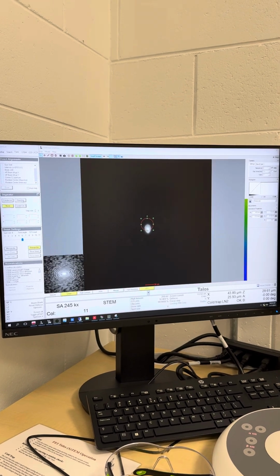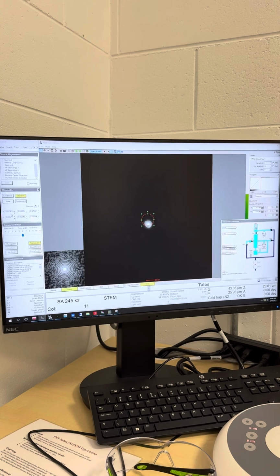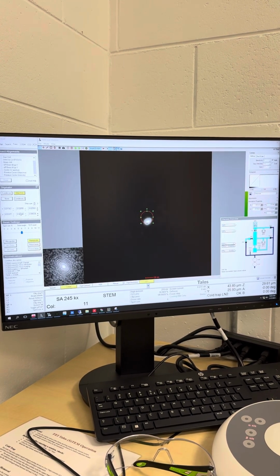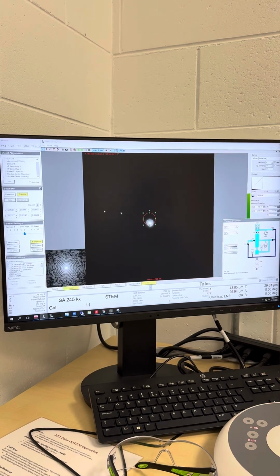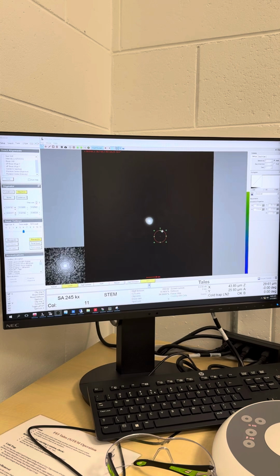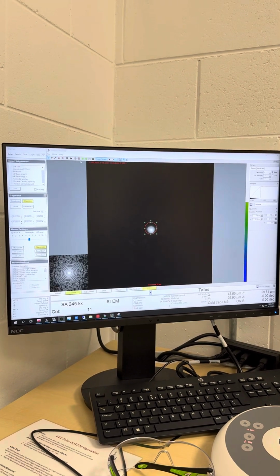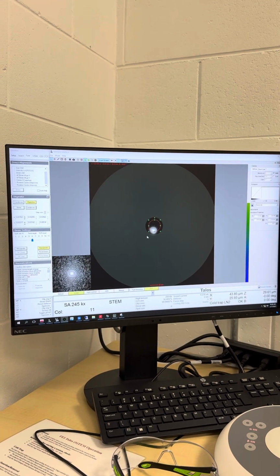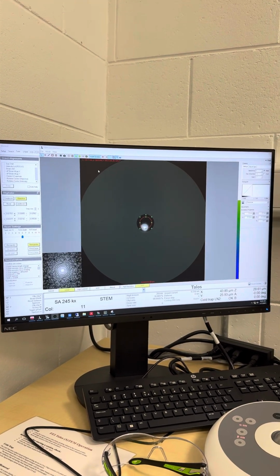Now we can go to the objective and just roughly adjust the shape of the beam. So they're good. A couple of settings here. The first one is always good, but just go through each one of them and pick the one that makes the shape of the beam better. Oh, my voice is gone. Okay. So now you don't need to bother about centering the beam. You just go back to the diffraction mode.